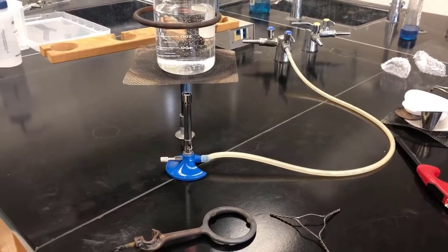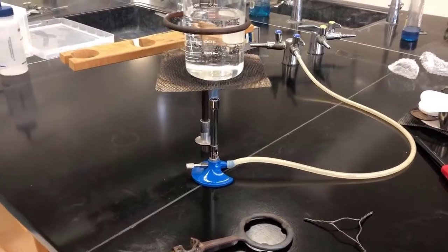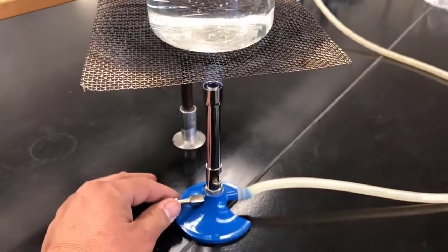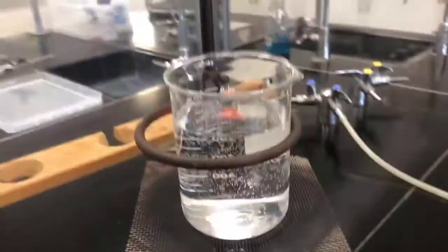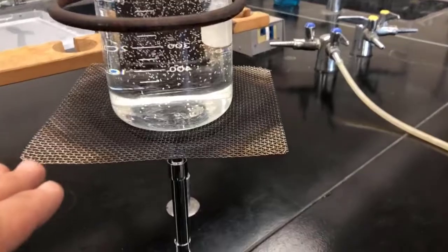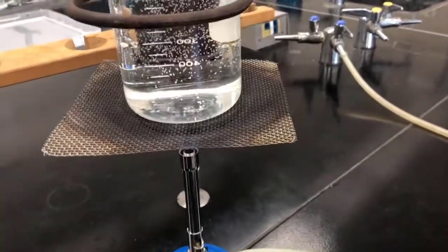I want to show you how to properly shut the gas off on this heating experiment. Sometimes this handle can get pretty hot down here, just because we're heating this object at the top — what it's basically doing is reflecting heat downwards.